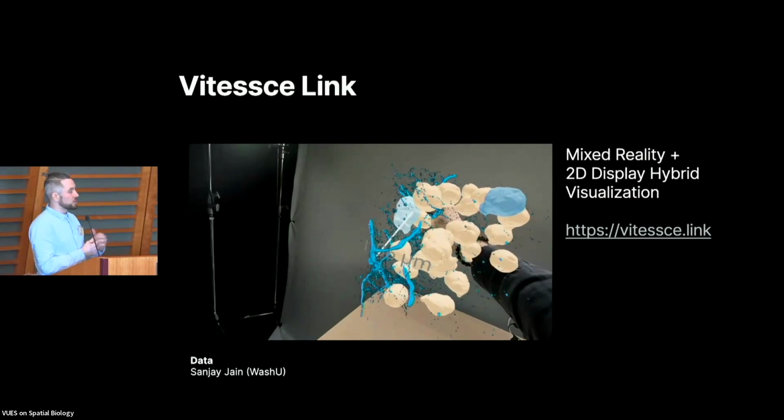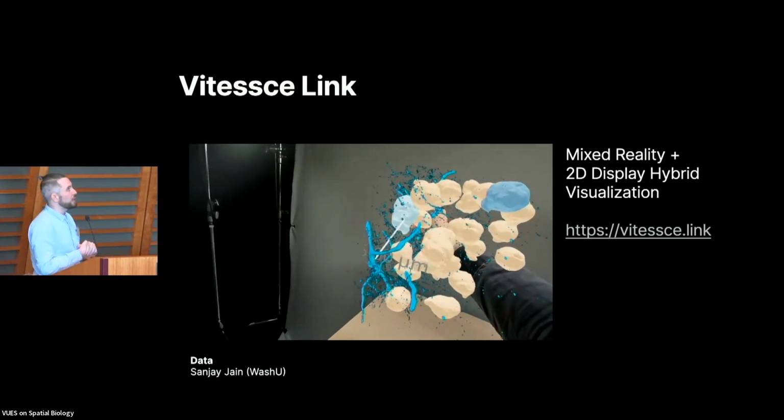And with that, we've also gotten the feedback from the biologists that it's way easier to now perceive the 3D dataset in real 3D and get a better sense of co-location of things because of the depth perception. And as you were able to see in this short video, we can use this tool to interact with the data. We can just shift our head around and change the viewpoint. And we can also, for example, add derived measures in the same tool.